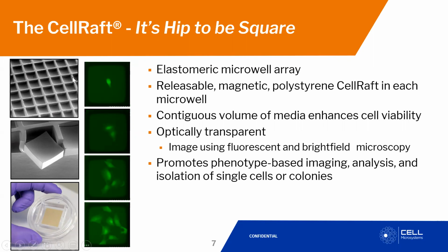The CytoSort array is comprised of an elastomeric microwell array, shown here. Within each small microwell, we fabricate a releasable magnetic polystyrene cell raft, which is the surface that the cells can attach and grow on.